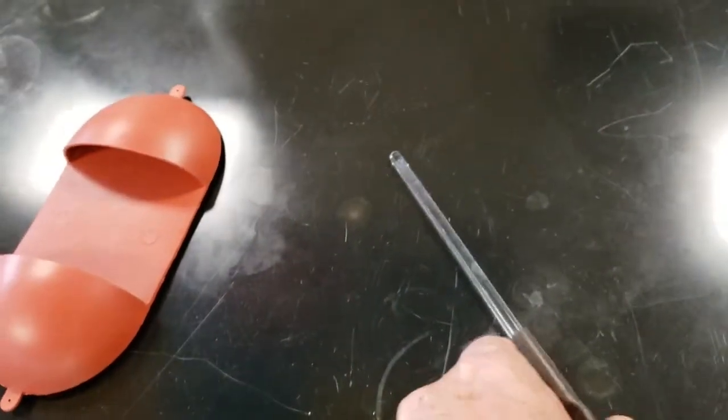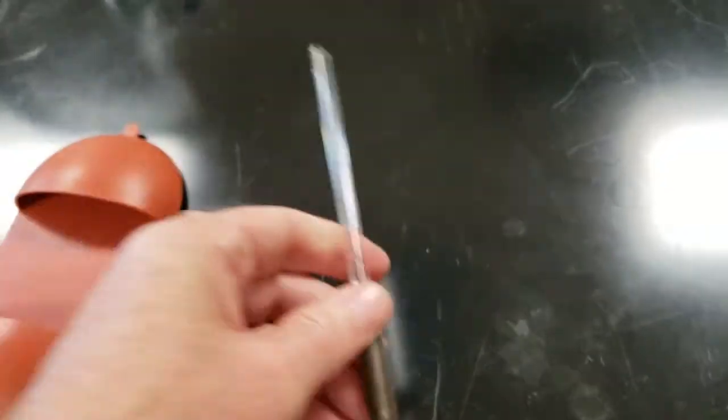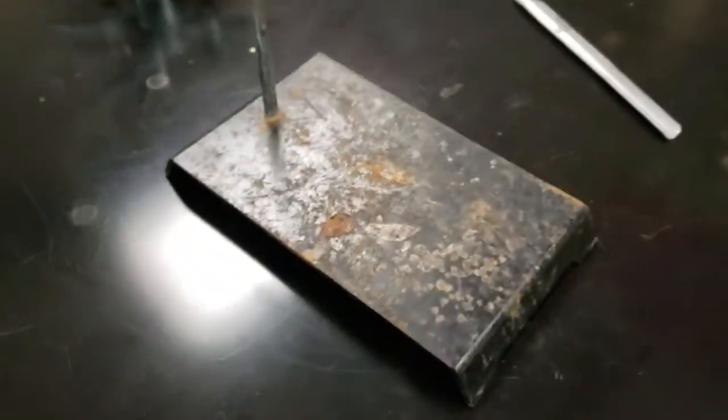Here's a glass stir rod. It's just for that, for stirring. And it has a rubber policeman on the back of it. A rubber policeman is like a spatula. You can wipe all the solids out of it here.